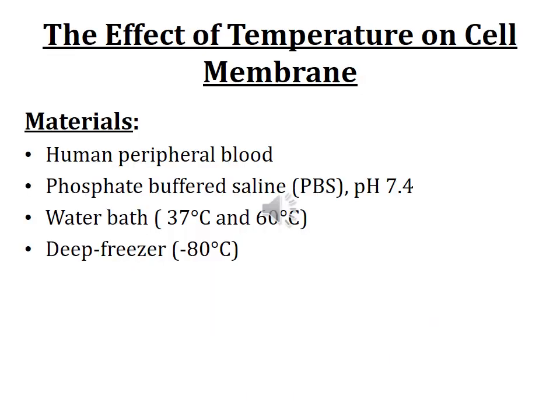Alright guys, so the first thing we're going to do is test the effect of temperature on the cell membrane. So let's move on to the next slide. This is just the materials that we need.